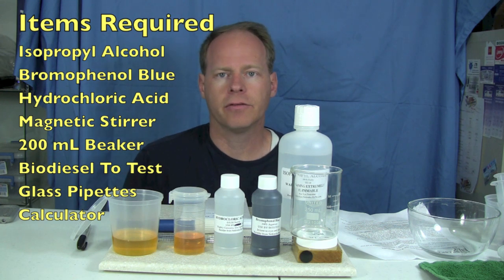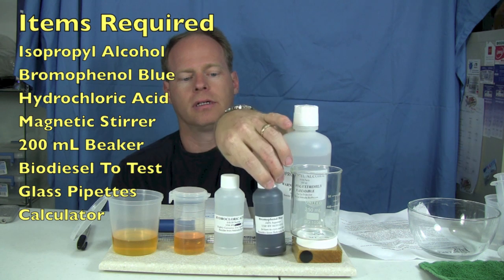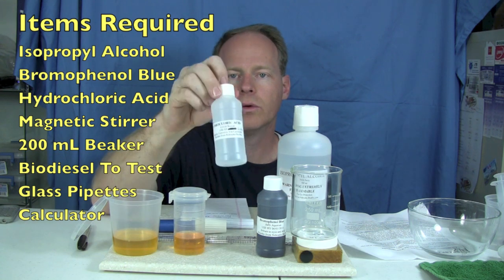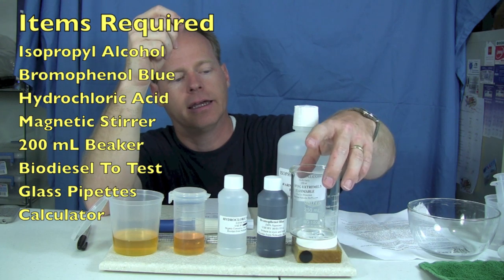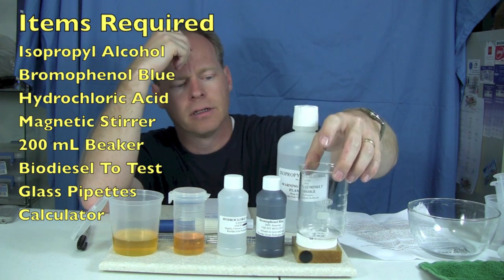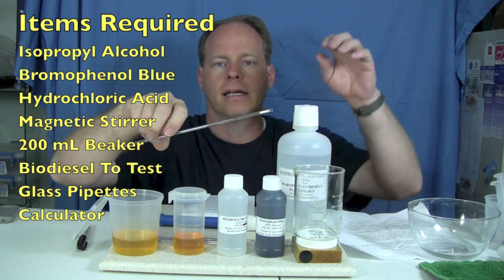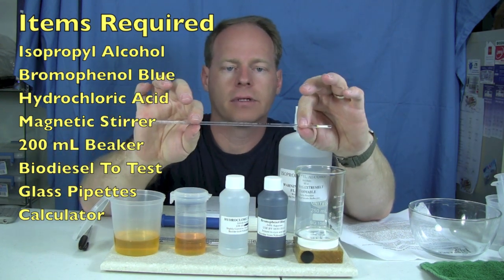To do this test you're going to need a few things: some isopropyl alcohol, some bromophenol blue, some very dilute hydrochloric acid — this is 0.01 normal hydrochloric acid — a magnetic stirrer, about a 200 milliliter jar, some samples of biodiesel to test, and you're also going to be using something called pipettes. We're using such small increments that these really come in handy.